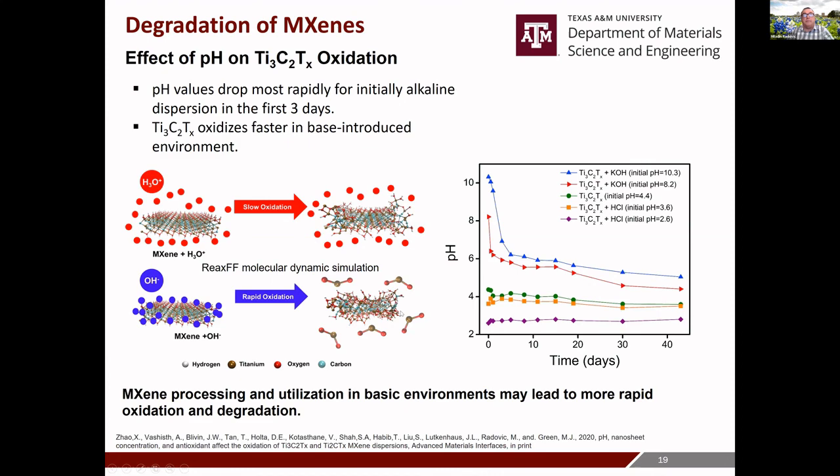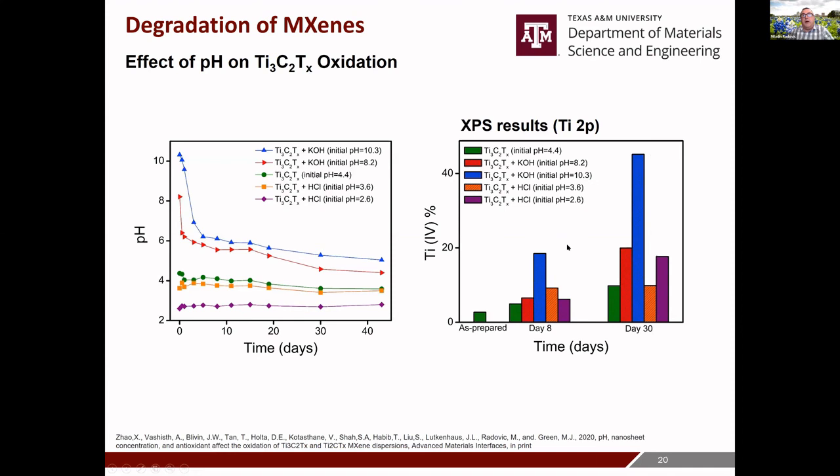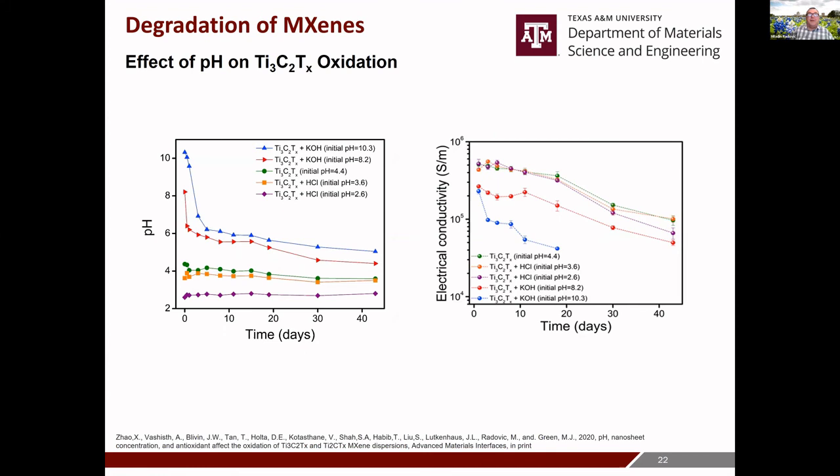So we can see here the corresponding XPS, that in the case of the acidic environment, the quantity of titanium oxides goes up with time. I'll skip these slides for practicality.